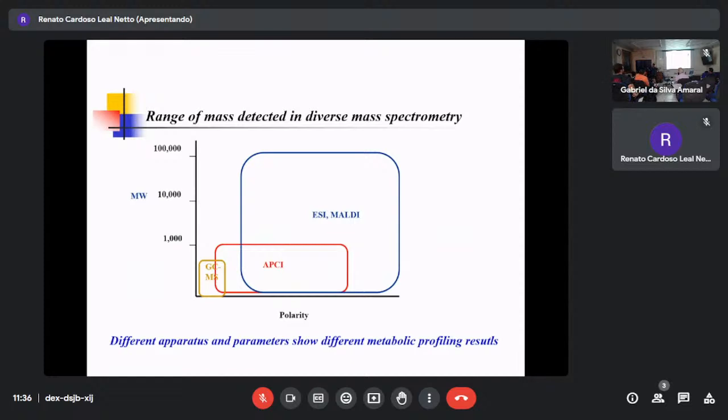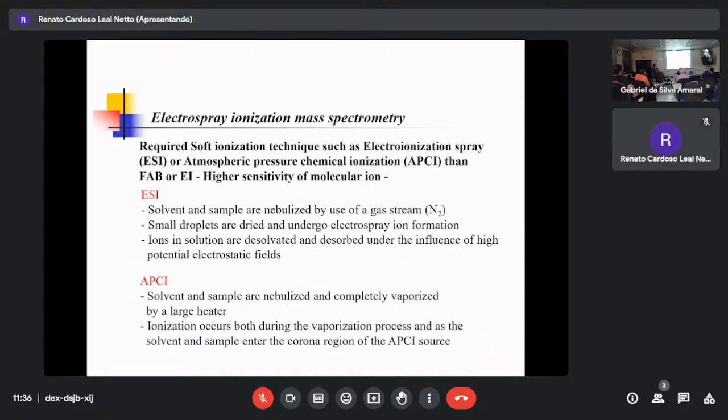But sugar is polar, but this non-polarity can be improved by chemical derivatization. ESI is the most common ionization method in mass spectrometry. ESI and APCI I have already mentioned very clearly. ESI and APCI are almost the same, but APCI needs an additional device to give an additional electron voltage.